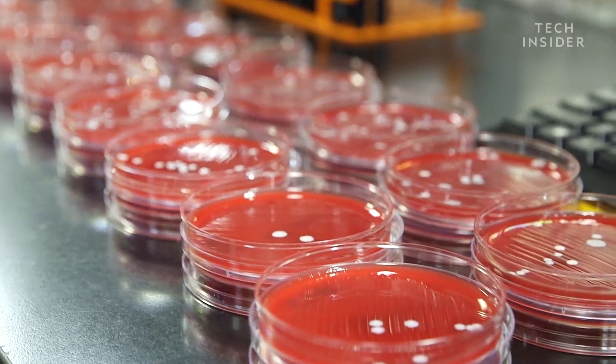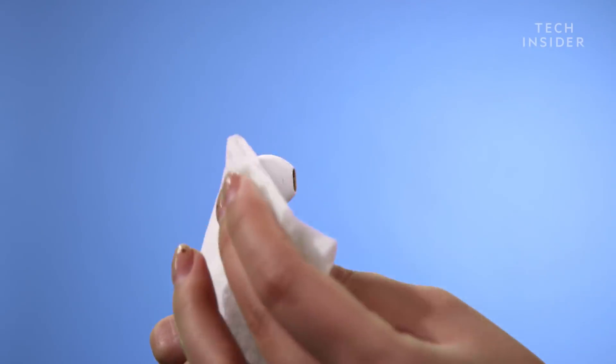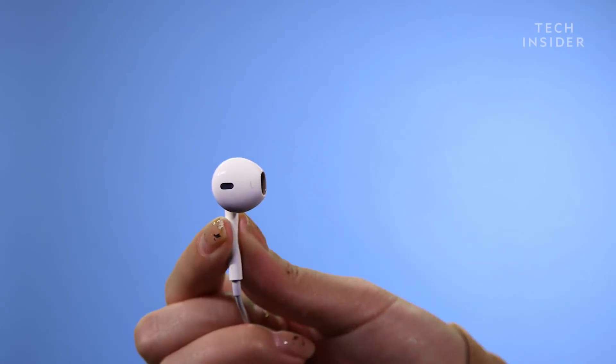We didn't know what we were going to find, and it turns out there are just normal bacteria. But I'd still like to keep my bacteria to myself. While we didn't find anything too gross on any of the earbuds, you still might want to consider rubbing them with an alcohol swab before going from a friend's ear to yours.